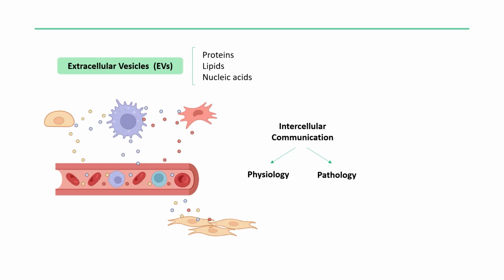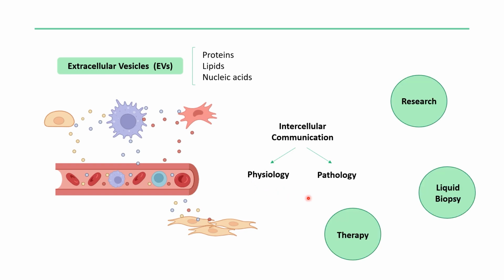Okay, so as you all know, extracellular vesicles have a complex composition that includes proteins, lipids, and nucleic acids, and have been involved in intercellular communication both in physiological and pathological conditions. So there's a lot of interest both in research but also in therapeutic applications of these EVs and in their use in liquid biopsy for the search for non-invasive biomarkers of disease.